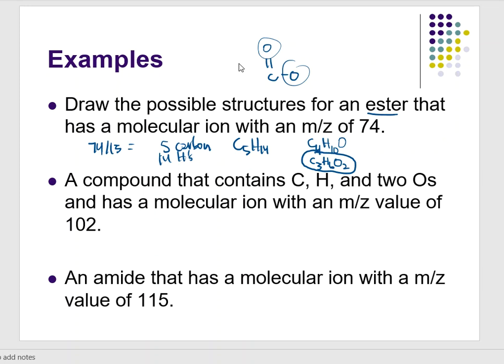And look at what I just did, people. I knew the functional group. How can I get this functional group? That's easy. Do an infrared of it. It tells me this is an ester. I run that on a mass spectrometer. I use the M-peak. That's it. Just the M-peak alone. And I'm able to determine that this molecule has 3 carbons, 6 hydrogens, and 2 oxygens in play.